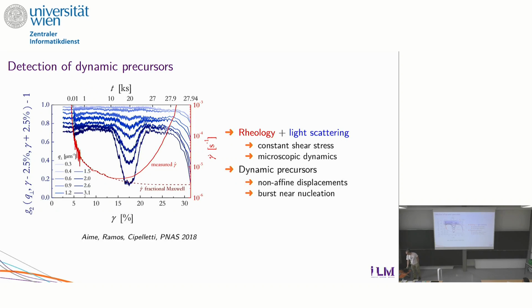For the detection, the answer is yes, and that's not because of me, that's because of Stefano, Laurence, and Luca Cipelletti, who looked at coupled rheology and light scattering. And same kind of experiment. So this red curve is more or less the same one as what I showed you before.